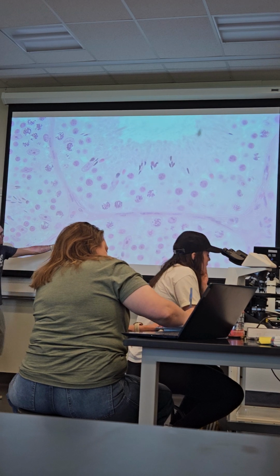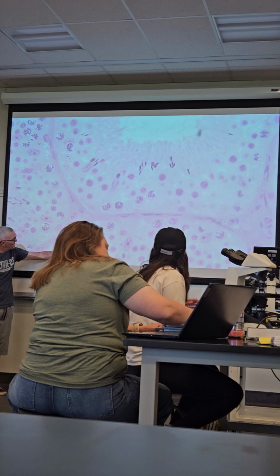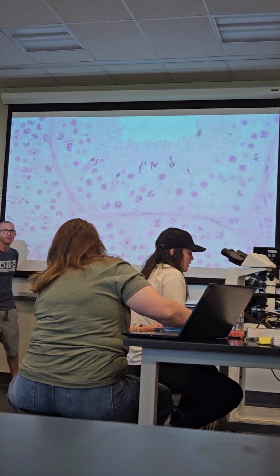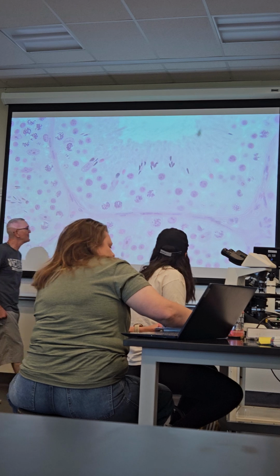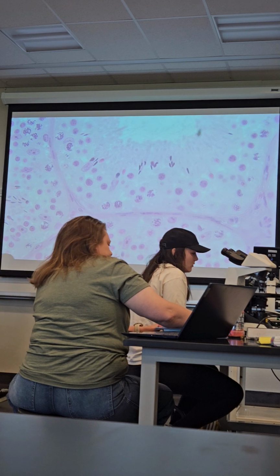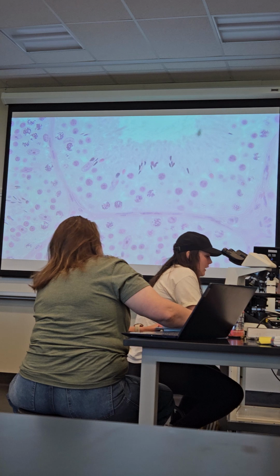What is that? Spermatocyte. And what is that plus these little pencil shaped guys? Spermatid. Spermatids, and they're all just stages of sperm production. We left this one off right here that doesn't look speckled, right on the basement membrane. Spermatogonia. You can put the same function for spermatogonia, spermatocyte, and spermatid. They're just stages in sperm cell development.